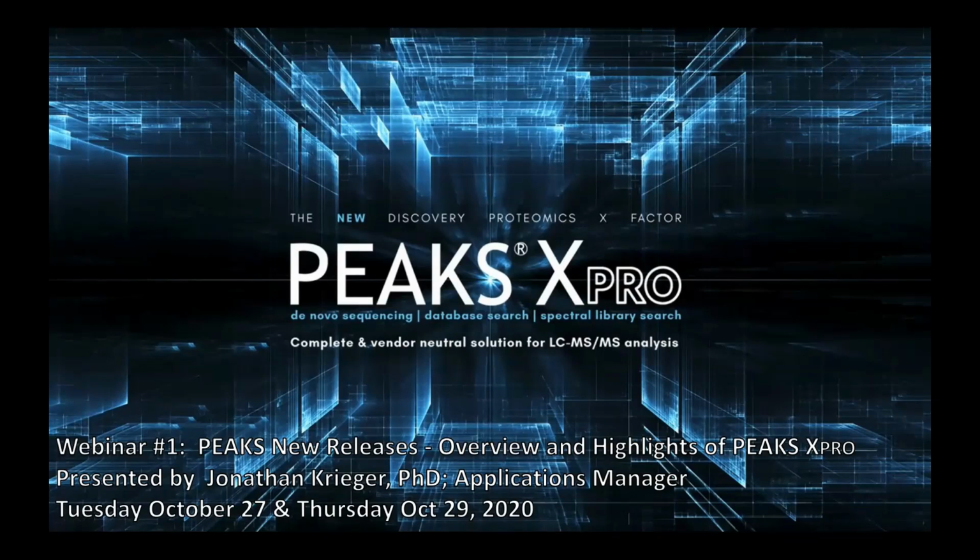And so what I wanted to do is give you an overview of the PEAKS Xpro release. The purpose of this overview is really just to highlight what's changed specifically with both studio and online versions of PEAKS Xpro, and highlight sort of what's new in that.